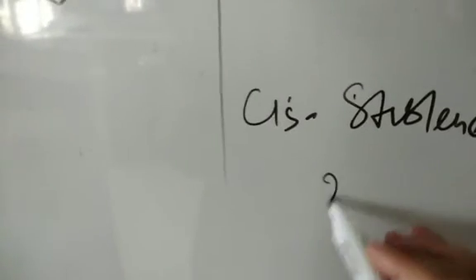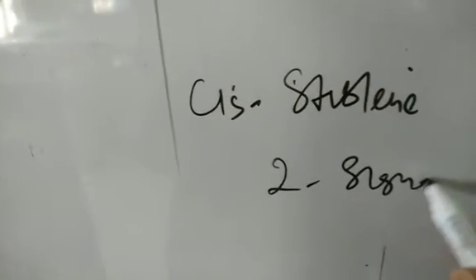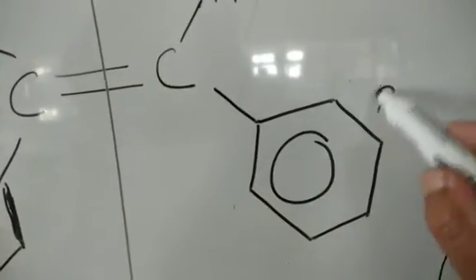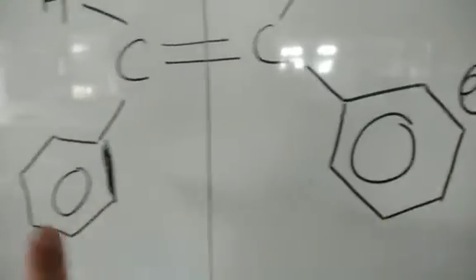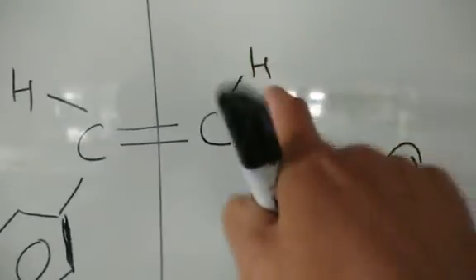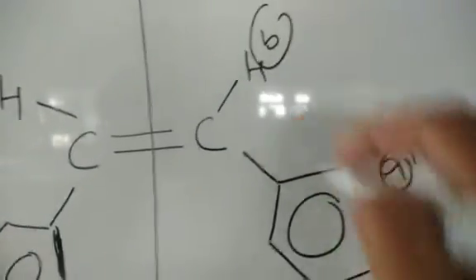So you have two signals. Now the aromatic protons are highly deshielded, followed by this. So this will get A, these aromatic protons, whose number is 5 plus 5, and this is B, the number is 2. So you have A and this is B. That means highly deshielded, followed by B.